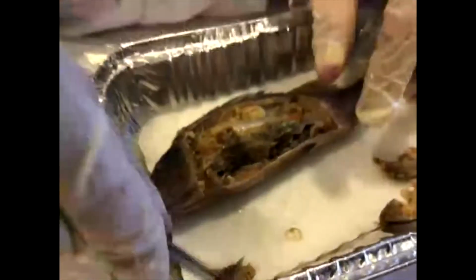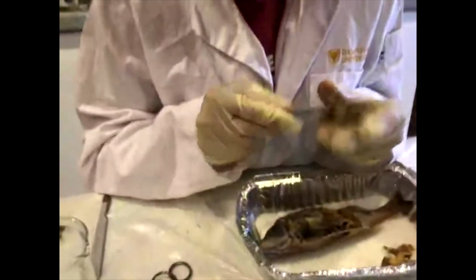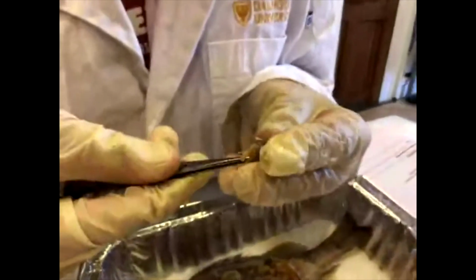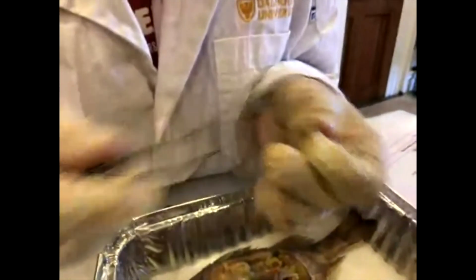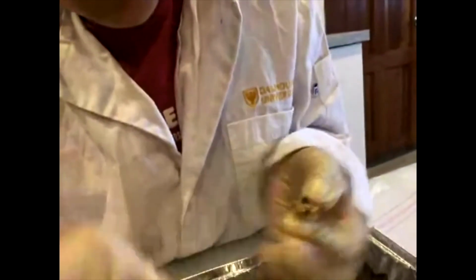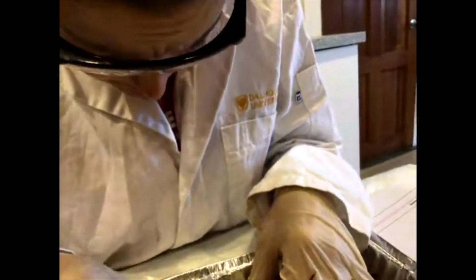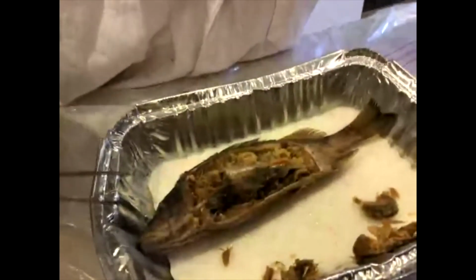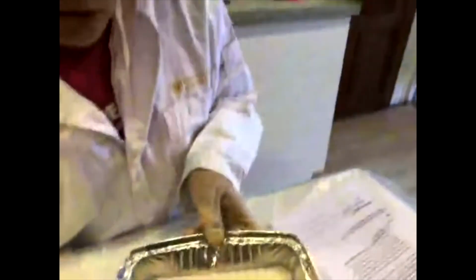So that was a little sidetrack from the heart. I think we have the heart here, but I don't think I did a very good job at extracting it in one piece. This is actually not the heart. I think we've left it behind. So maybe we'll have to skip that one for today. I think our best image of it was probably on this one. We'll just take one more look. It's that organ right here, kind of nestled in amongst the gills.